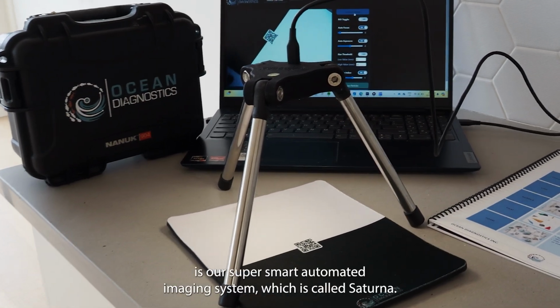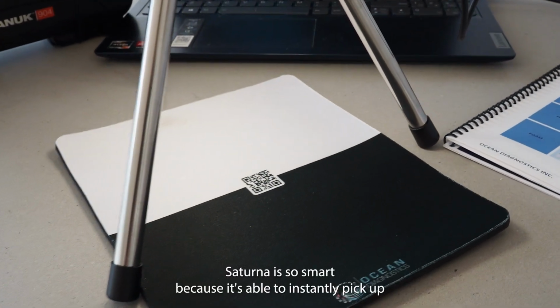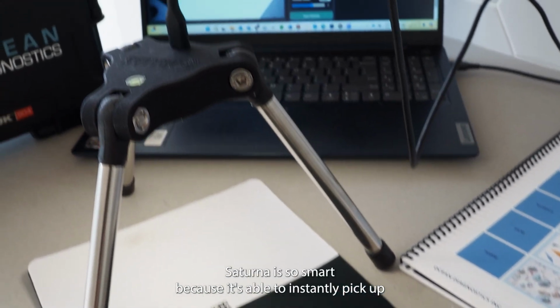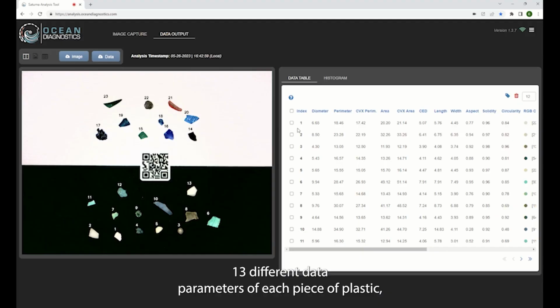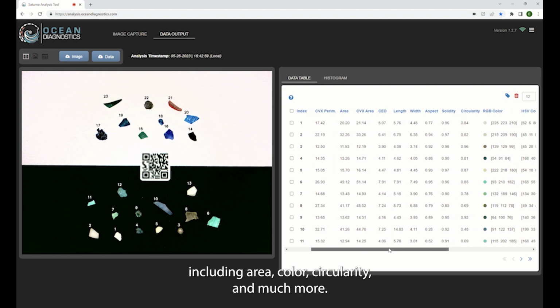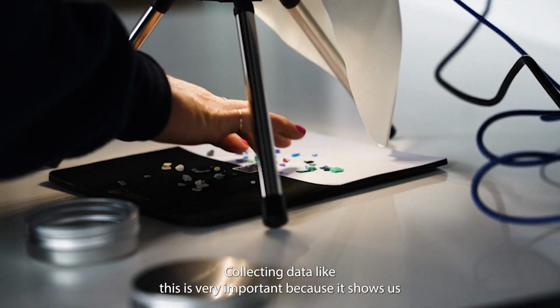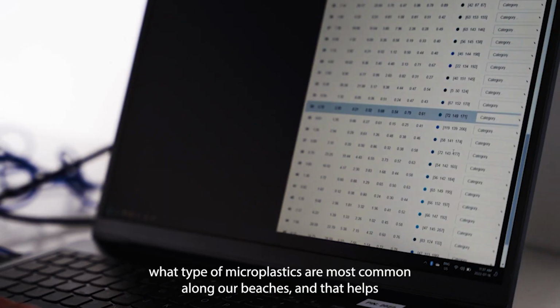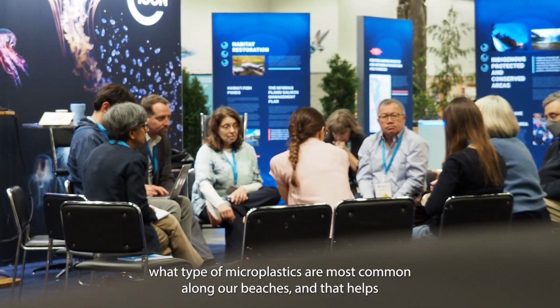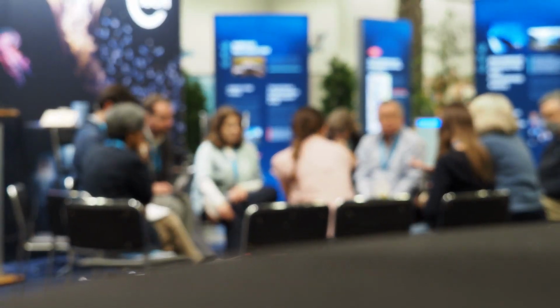In front of me is our super smart automated imaging system, which is called Saturna. Saturna is so smart because it's able to instantly pick up 13 different data parameters of each piece of plastic, including area, color, circularity, and much more. Collecting data like this is very important because it shows us what type of microplastics are most common along our beaches, and that helps to educate the public and decision makers on the impacts of microplastics.